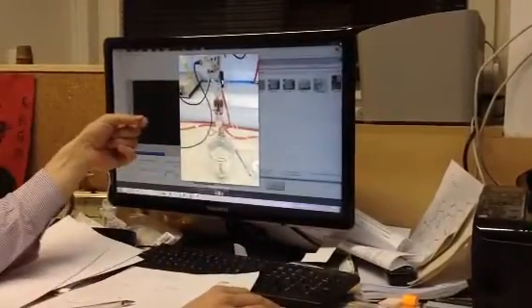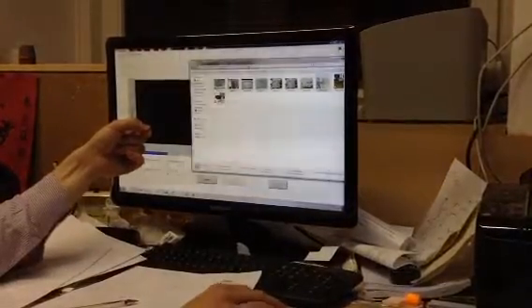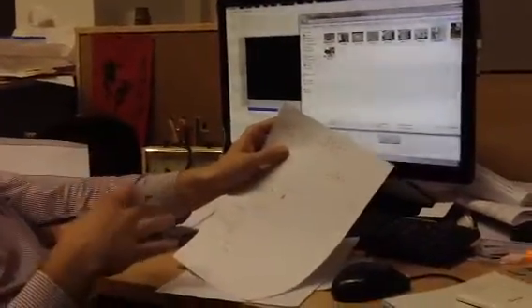You can then press the tube and add the zero calcium or calcium-free media and fill it. This is the way of lowering the calcium concentration. Of course, in this case, the contractility will decrease. The baseline is lower, the frequency, the amplitude. Sometimes you cannot really see any contraction waves. Okay?